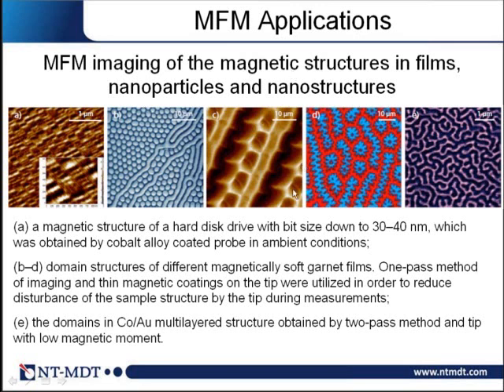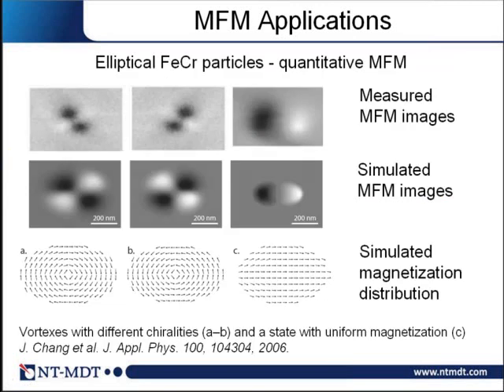Okay, here we have another example of an MFM application where a single ferrochrome particle has been imaged using MFM. And this example shows you the possibility to analyze MFM images quantitatively.